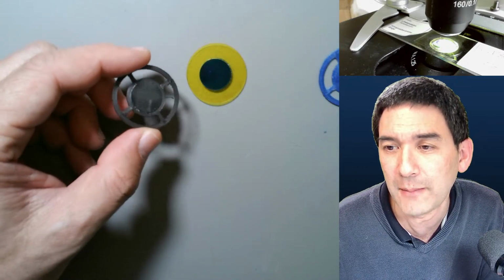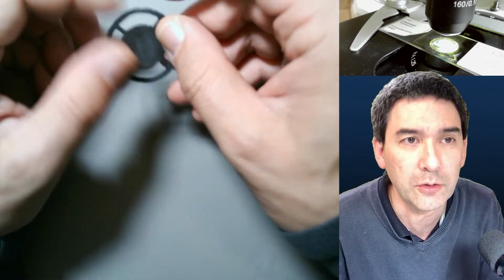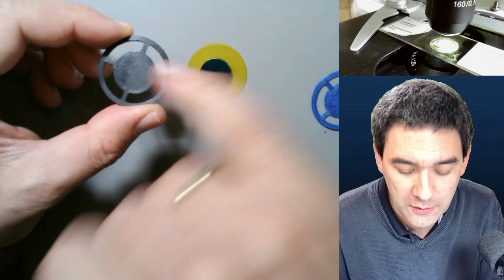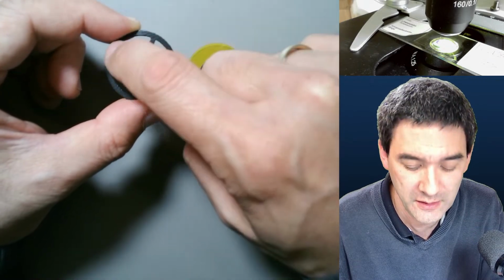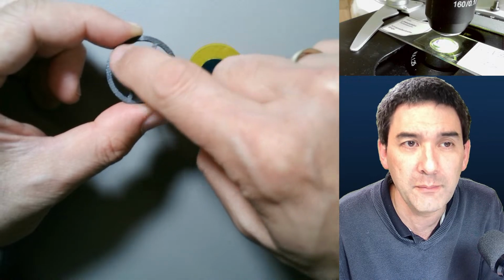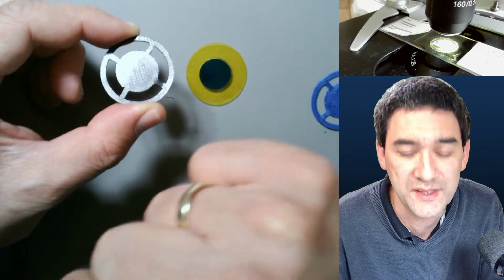What's the difference between dark field and oblique? Do you have an example of an oblique patch stop? Okay, let's put it this way. You can have a regular dark field filter, right? There are certain oblique filters where basically only one of the quarters is actually open. The rest is black, and the main light is blocked out in any case, and then you only have light striking from one side, and that will give you a slightly three-dimensional view.